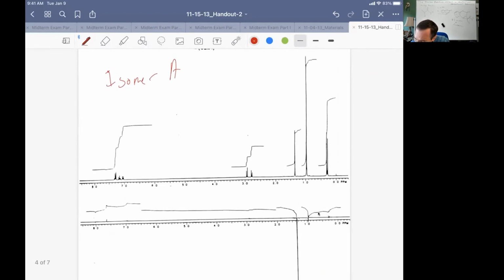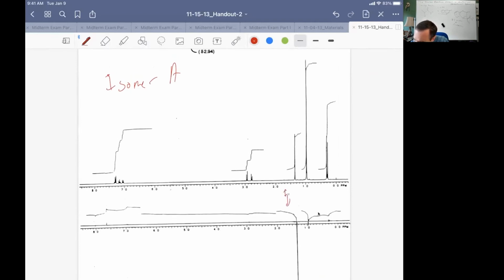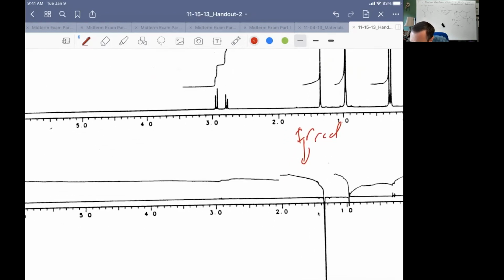We irradiate the methyl. And I look at those ring protons and I've slapped an integral on them, and you can see one here, and well, you can see the integral of the other here. And there's not much, they're very small. I think I measured them and I think they were both about 0.5 millimeters.